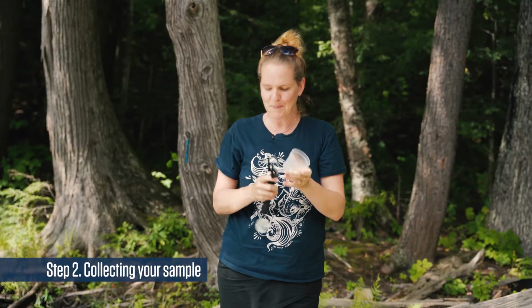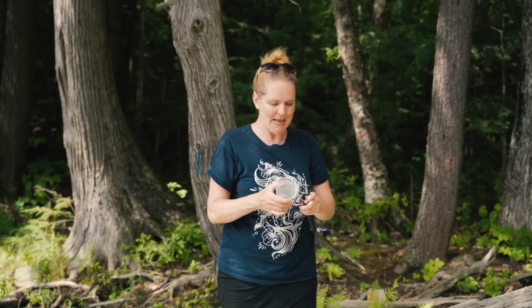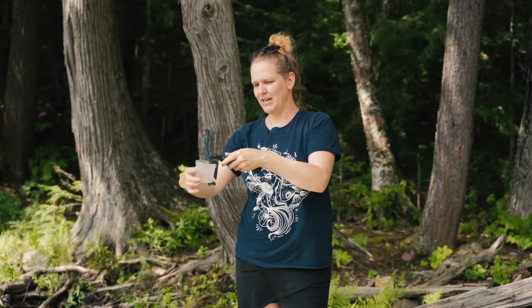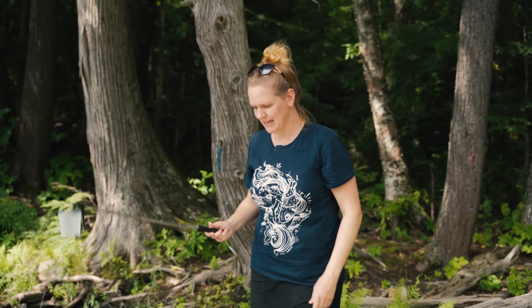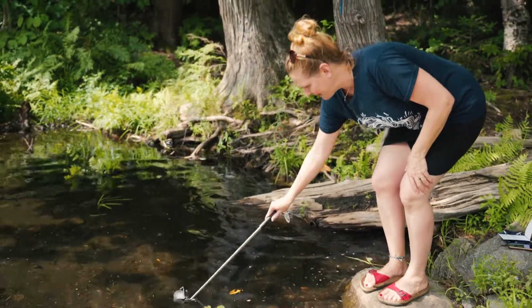Next, I'm going to get my reacher stick out and my sample cup. You can reach in with your hand, but for safety reasons and because sometimes your hands might have hand soap or sunscreen on them, it's really best to use your reacher stick to go into the water. I'm going to stretch it out, tighten the little thing, extend it out like this. And I'm going to rinse it 3 times in the water I'm testing.